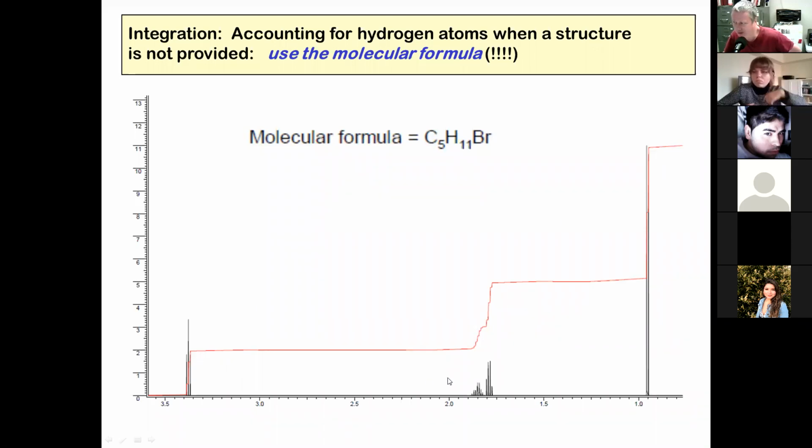So yeah, this one looks like a half one. Yeah, that's like a single. That's a CH. That's a CH. I'm thinking CH2, CH, CH2, right? That's 5. And then 2 CH3s, right? Without even considering the structure. We're not even considering the structure yet. We're just looking at the red curve and how we add up to 11, right?